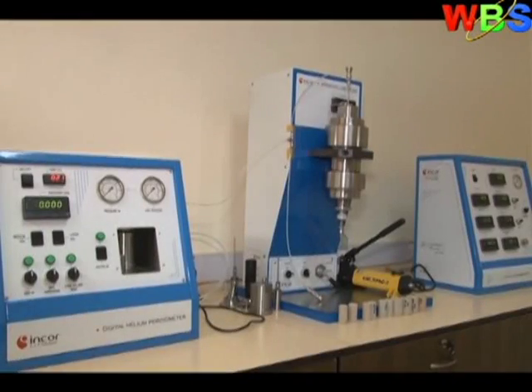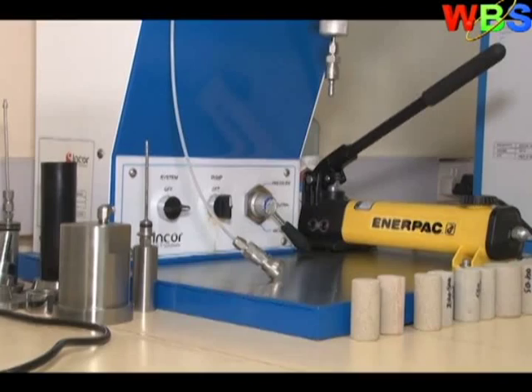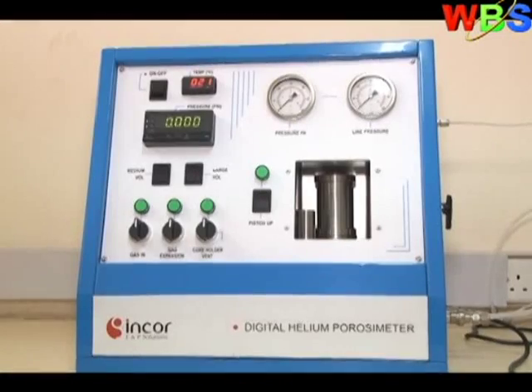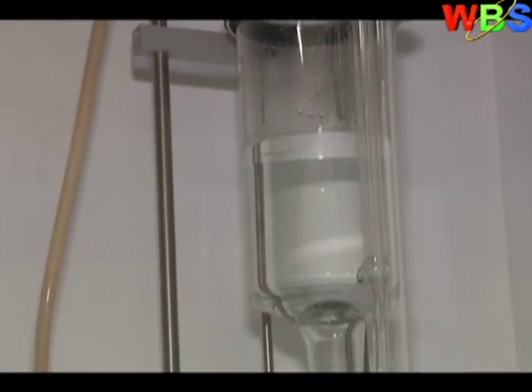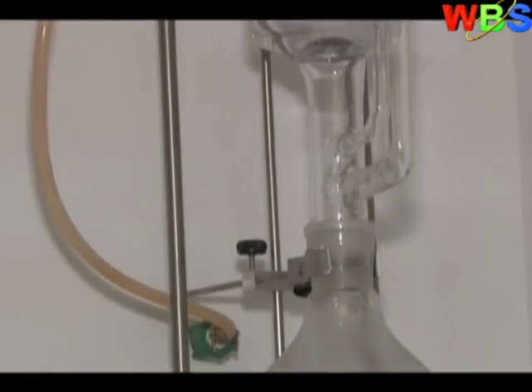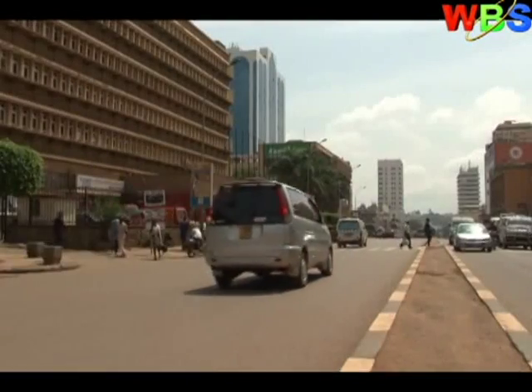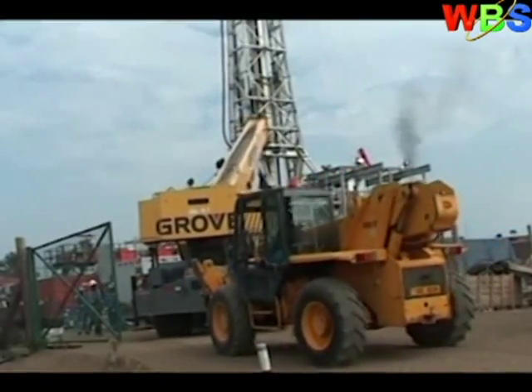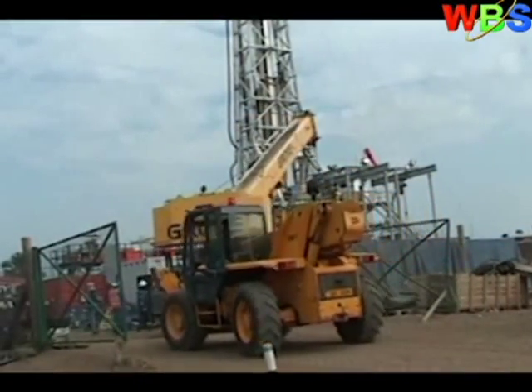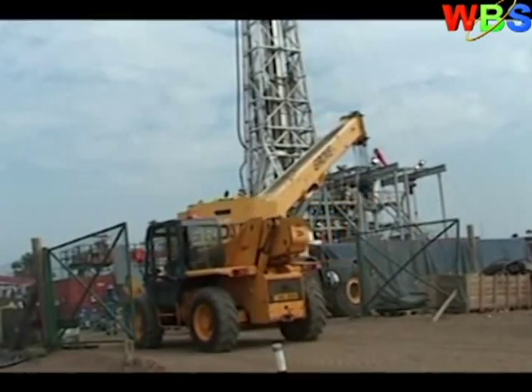The laboratory will test rock samples to determine the potential of a given area to produce oil through a process called core sampling. Core sampling is one of the most accurate ways of understanding the characteristics of oil and gas reservoirs. Though based in Kampala, miles away from the Albertine region in Bunyoro, Andres Moran feels the distance is not a problem, as it is the culture in most countries endowed with oil. This is a standard thing that happens everywhere.